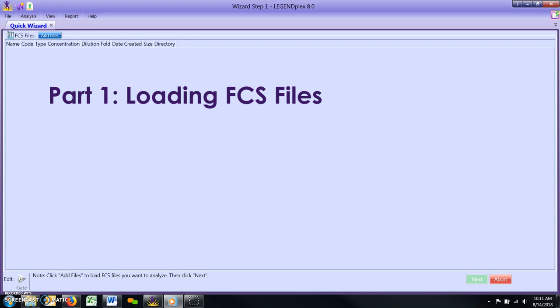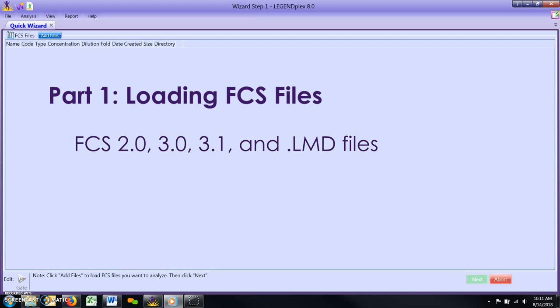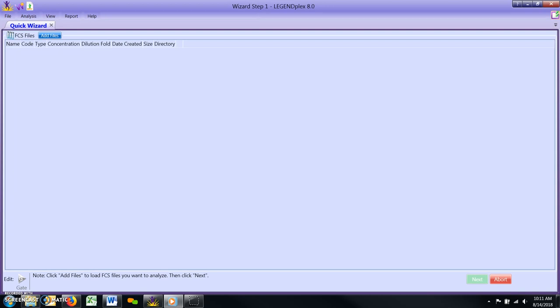The LegendPlex data analysis software supports the following file types: FCS 2.0, 3.0, 3.1, and .LMD files. In addition, all FCS files from your assay need to have been acquired under exactly the same flow cytometer settings in order for the software to be able to analyze them together. Be sure to load all files generated from your LegendPlex assay. This includes both standard curve files as well as those from unknown samples.